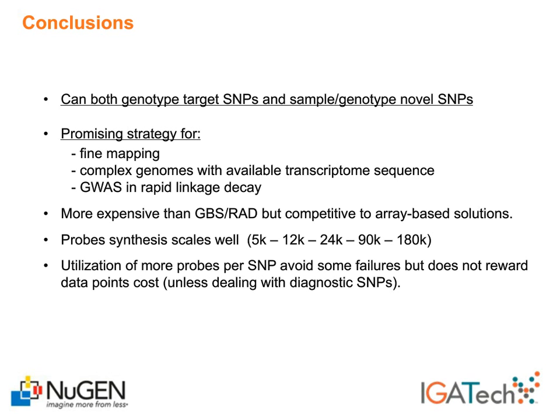And also the utilization of more probes per SNP can avoid some failures, but in our case does not reward the data point cost. However, if users are eager to deal with very important SNP sites, they can easily think about designing more than one probe per SNP site.